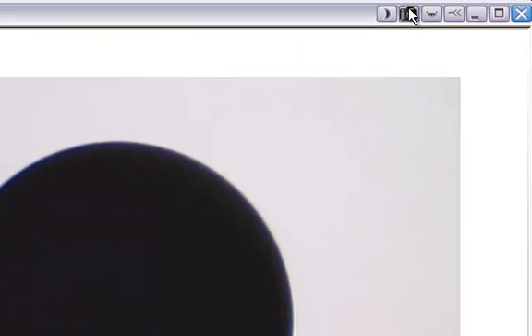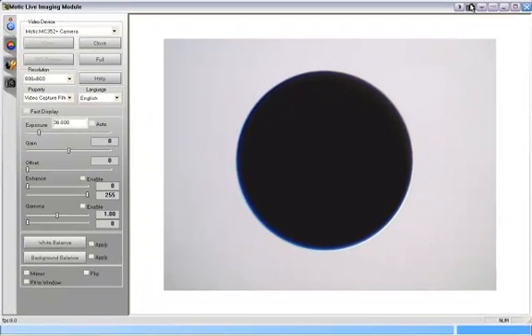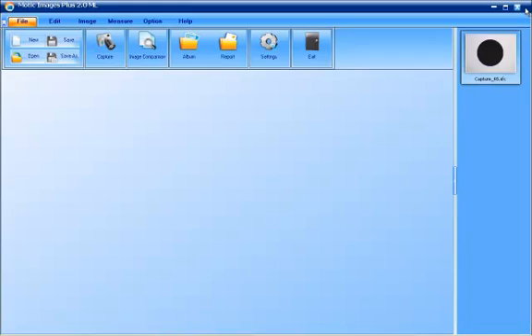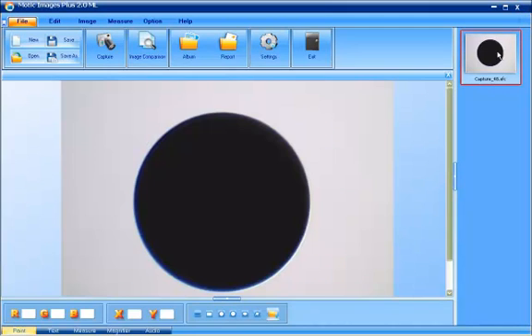After you've focused, click on the capture shortcut and you can close the image devices now.